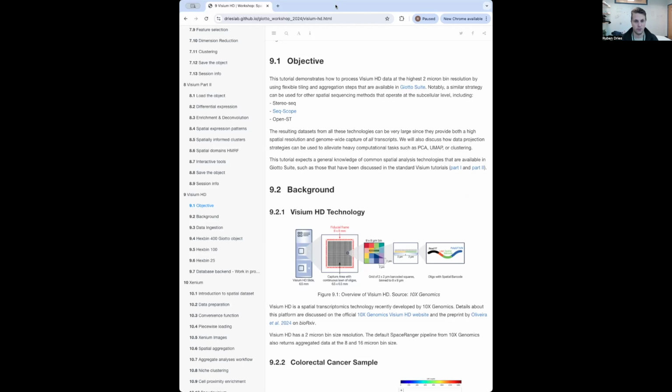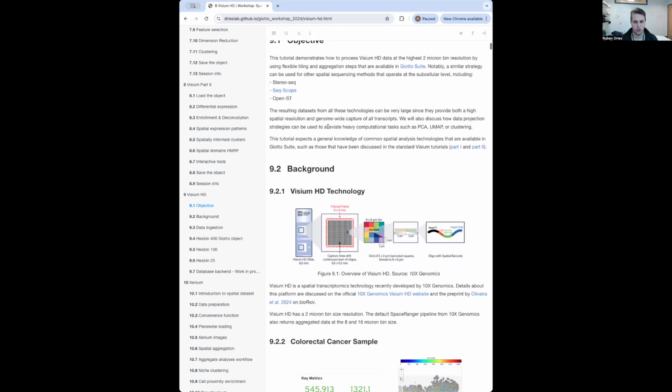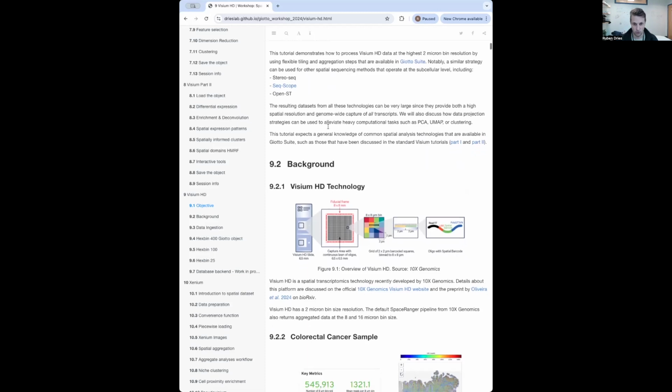There's a lot of different cells within a single spot, and this is why you had to do deconvolution and think about what are the different cells that are available. So it makes interpretation a little bit hard, and I think that's hopefully what we can change, when people are moving into these new technologies.